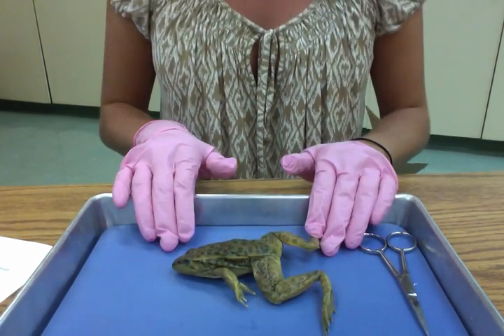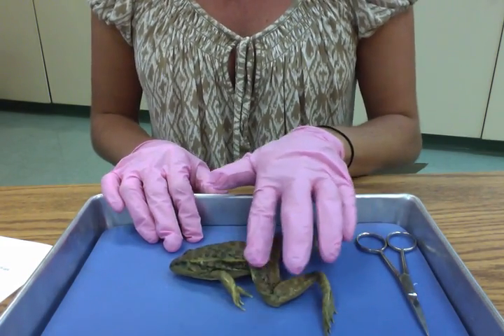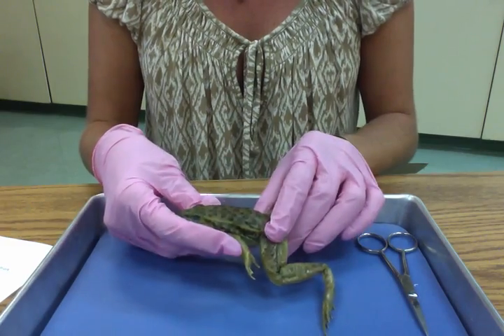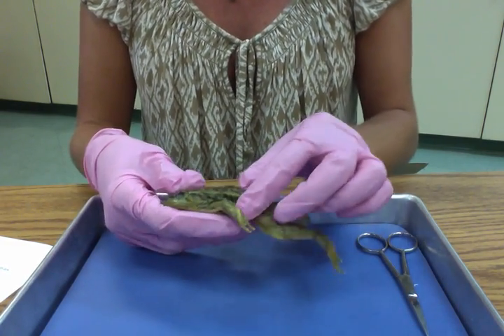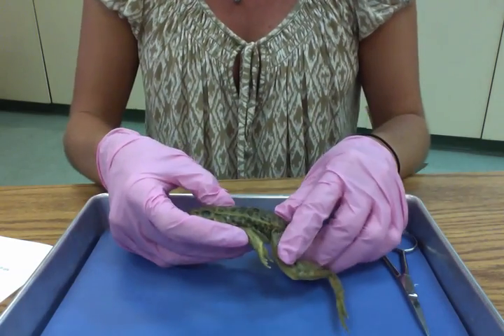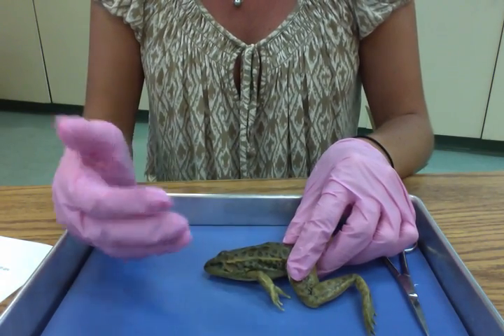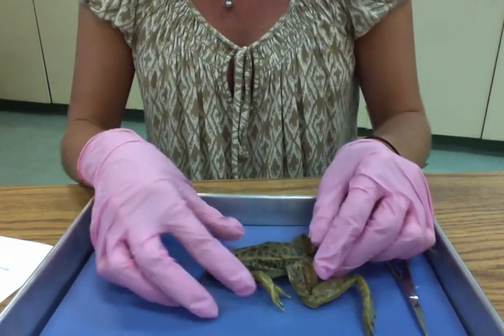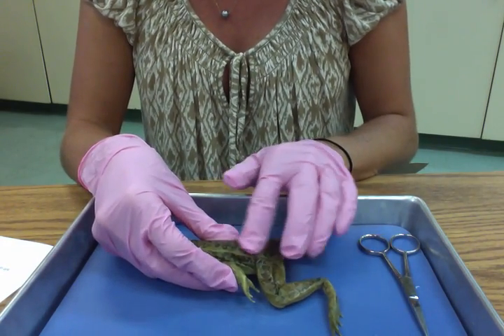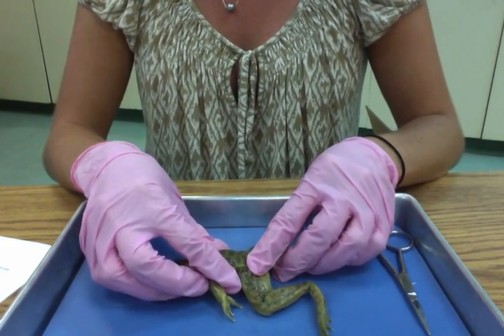So put your frog dorsal side up, back side up, and go ahead and feel the skin. Make some observations. Remember, observations involve sight and touch, so check out the pattern on your frog. Go ahead and lift the skin up, see how thin it is. Remember, amphibians breathe through their skin, so that skin will be very thin so that oxygen can easily permeate or go through it. So take a look at the texture. It doesn't feel very slimy, it's almost leathery. And record your observations in your notebook.